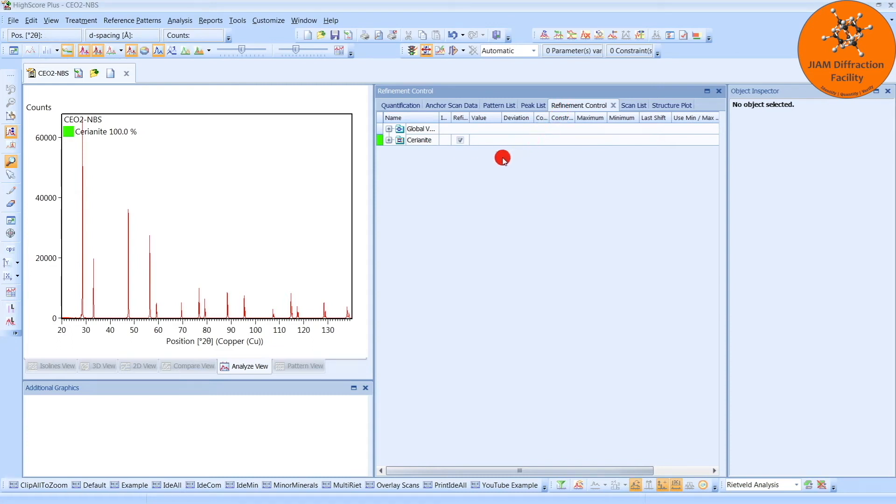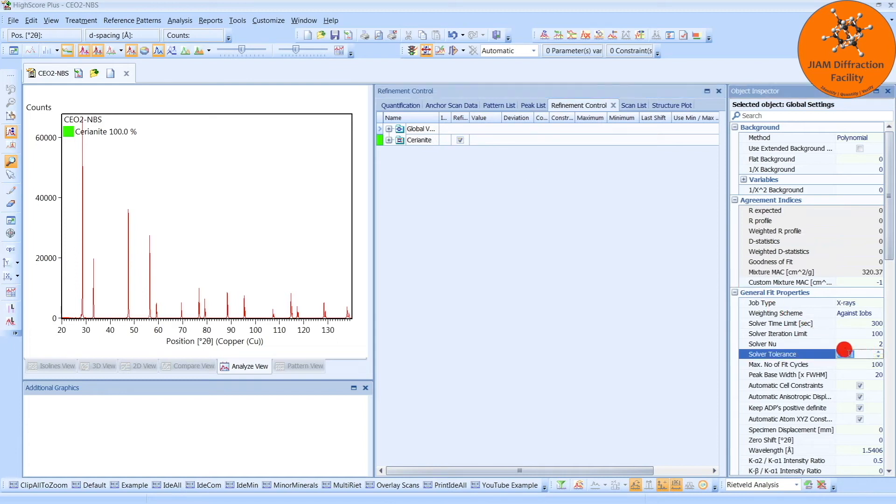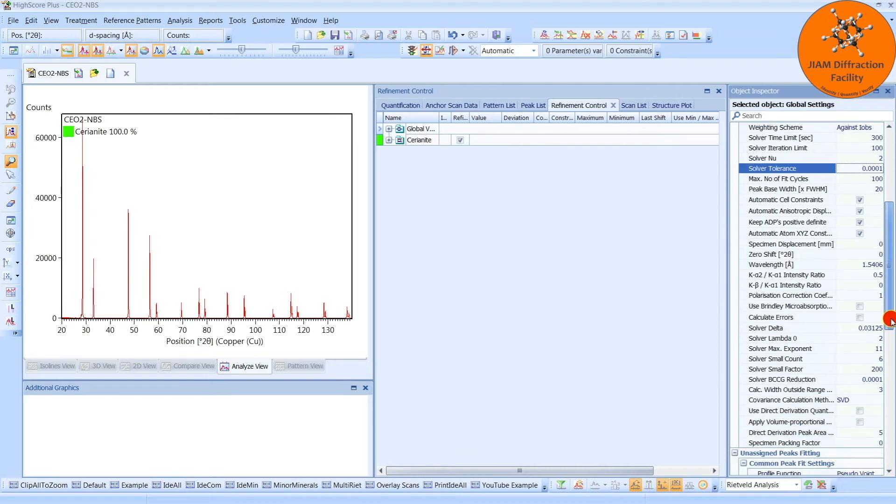Before we go on and perform a refinement, though, there are a few other parameters that I want to set. If we left-click Global Variables, I want to change this solver tolerance to something a little more demanding. I will enter an extra zero, Enter. I will also scroll down and click the box next to Calculate Errors.